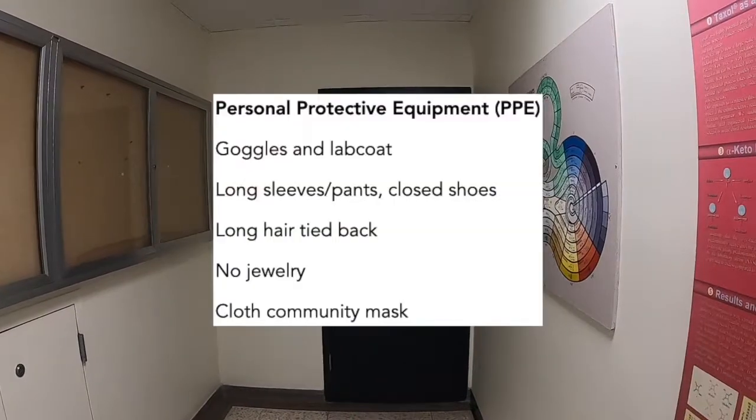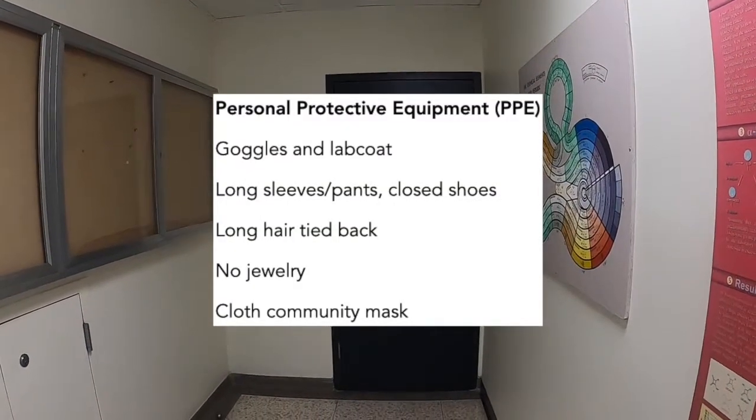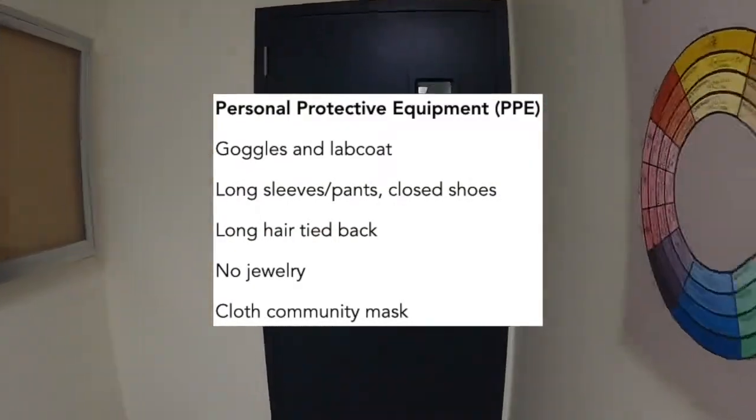As you enter the lab, make sure to put on all of your personal protective equipment, the same equipment that was discussed in the lab tour.